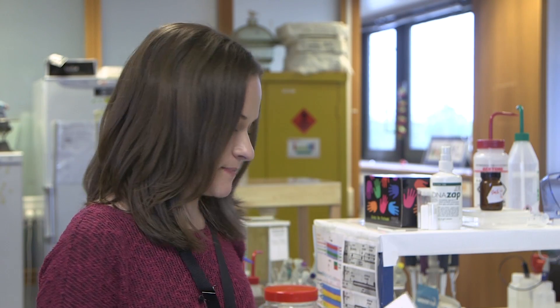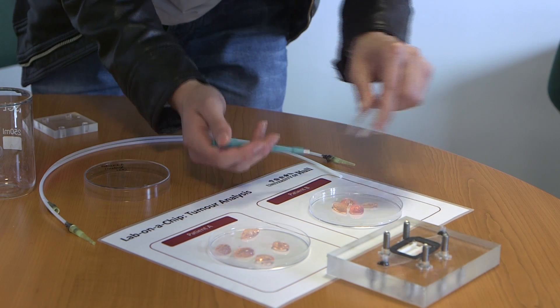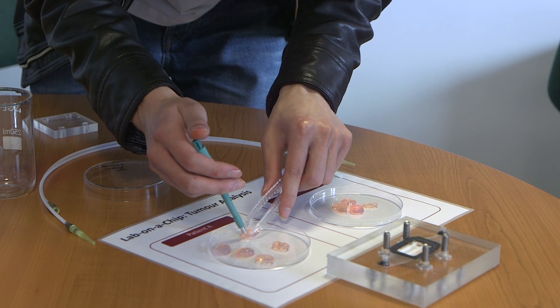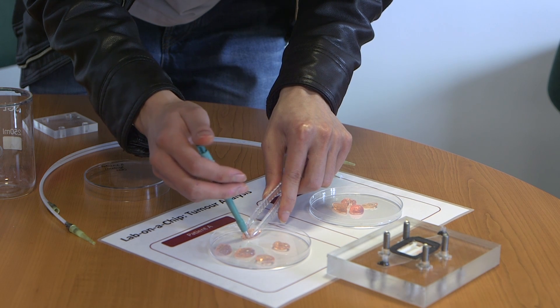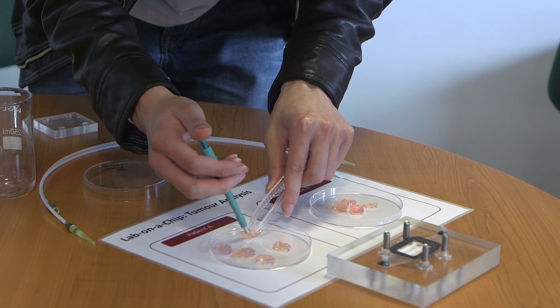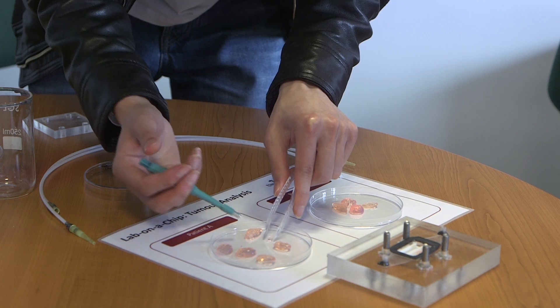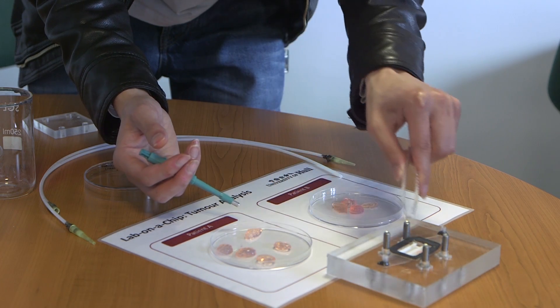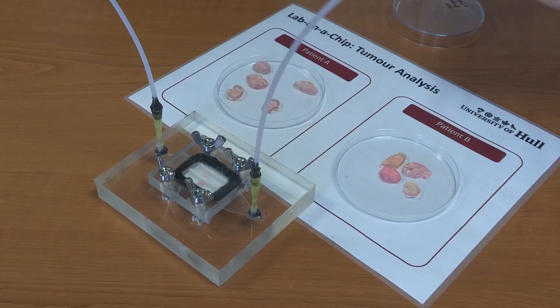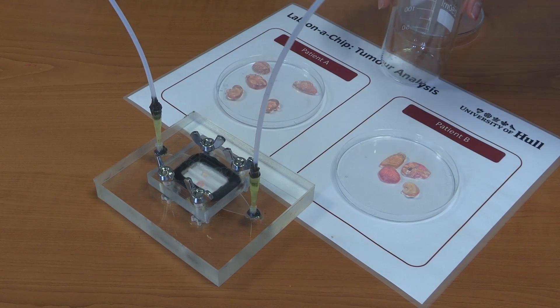In our tissue-on-chip experiment, we were demonstrating a lot of work that goes on in the School of Biology at the University of Hull, where we take patient samples — generally cancers — place them onto a microfluidic device and keep them constantly running with media, which is a kind of fake blood that keeps the tissue alive. This enables us to test different drug combinations and treatment combinations to see which is going to work best. We took our patient tissues in the gel that we have here and placed them into the microfluidic device.